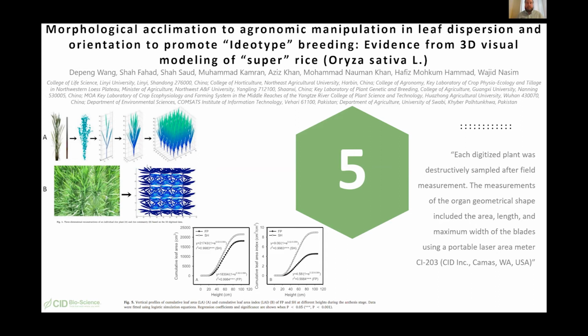And just because of these two practices, they were seeing large differences in leaf area index. They were using that to help build the data collected of leaf area index, and the changes that they were seeing were used to help build this model that could then be used to help predict these changes in further analysis.